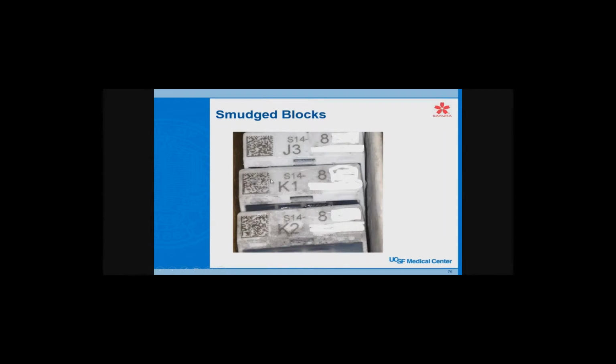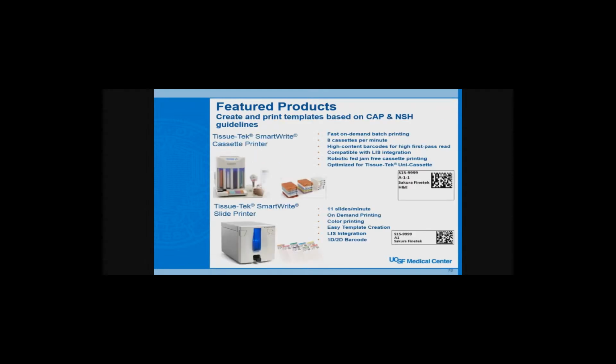Our general label, just a few pictures here. This is our consult labels, slightly different color, designed to stick to a person. Then our pathology label, this is our old label, this is our new label for the Cytex machine. You still have problems with grossing. If they put too much ink and it leaks out, it can affect the barcode. These wouldn't read. We had to reprint these cassettes.